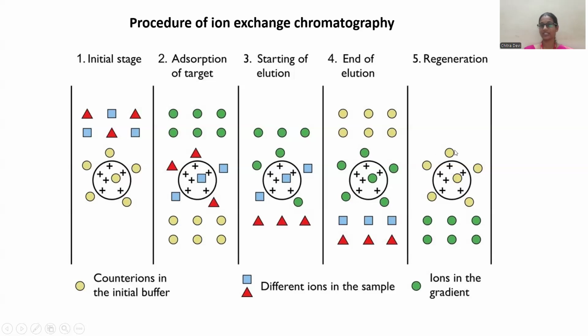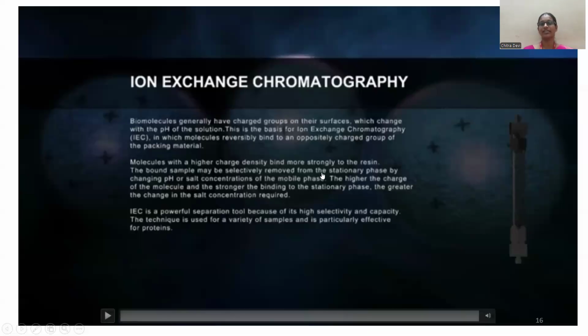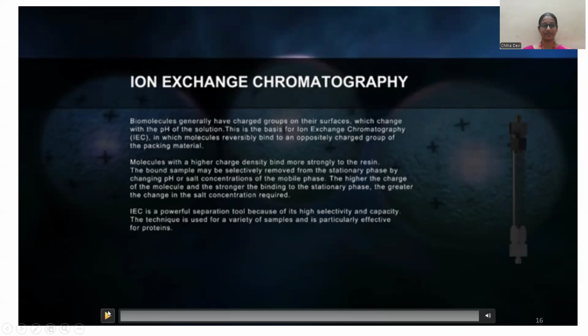The fifth step will be regeneration. Again the initial stage will be restored, so likewise it has to be regenerated. That is what we'll be doing here. Now I'll show one video that clearly tells the steps in an animated form.